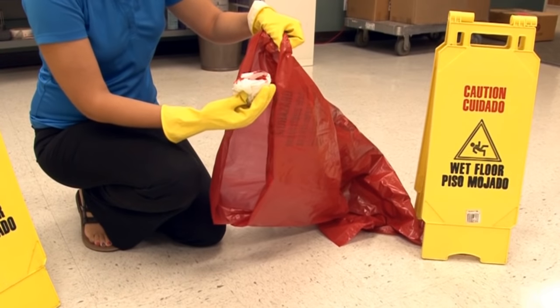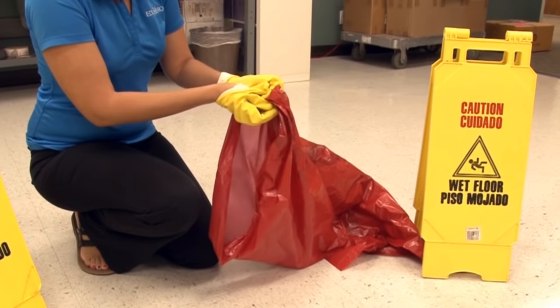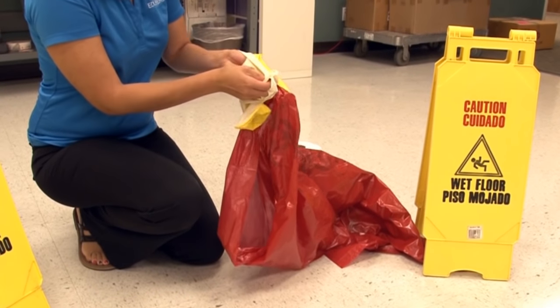Put the contaminated paper towels in the biohazard bag. Turn your gloves inside out as you take them off and put them in the bag as well.